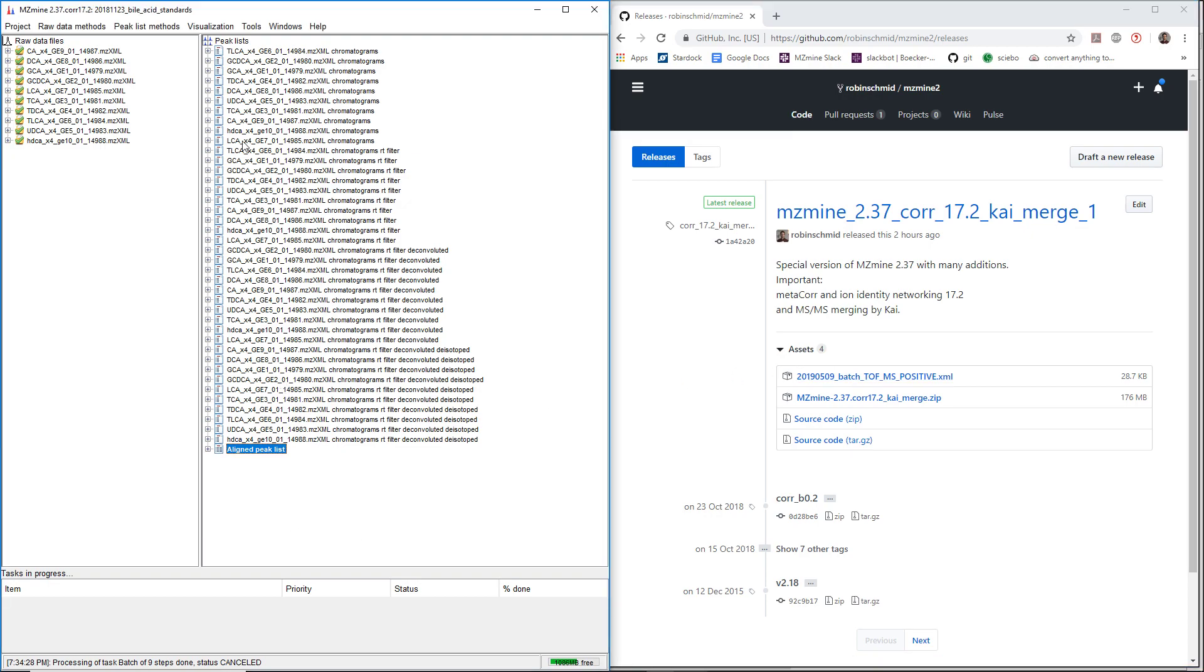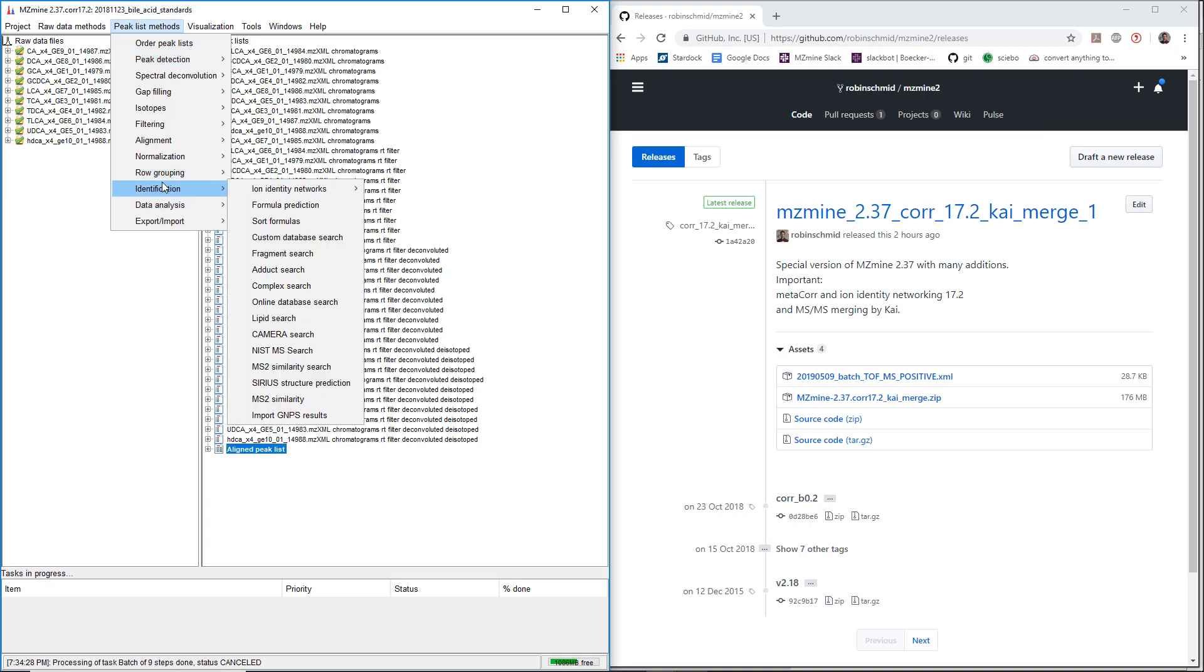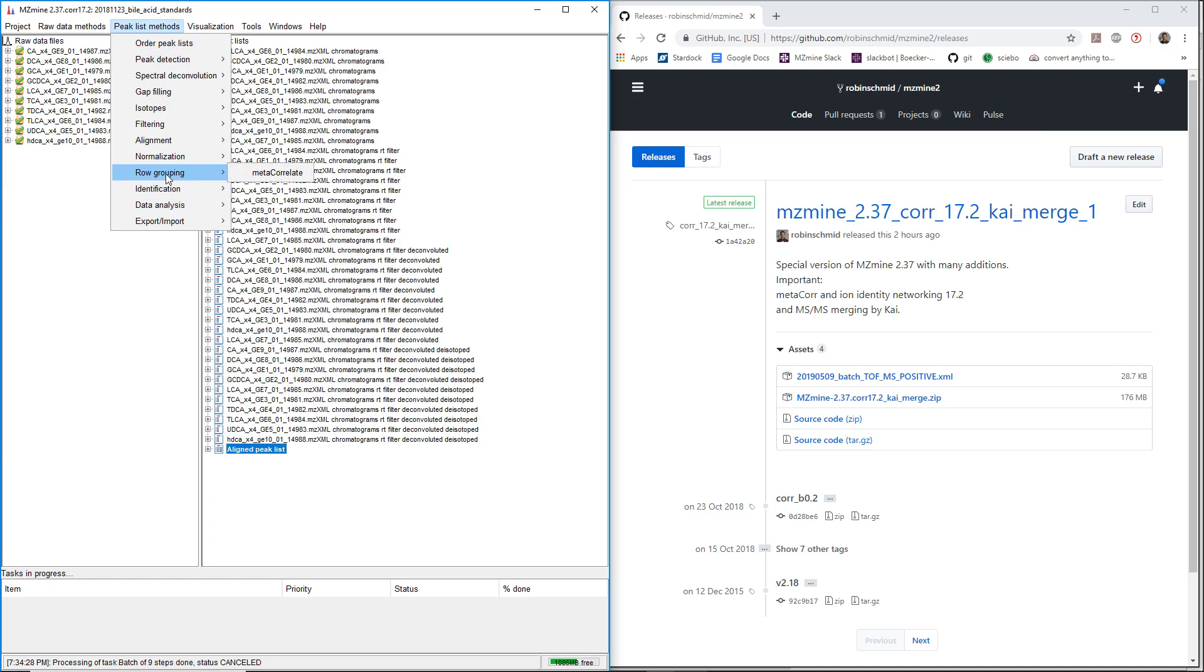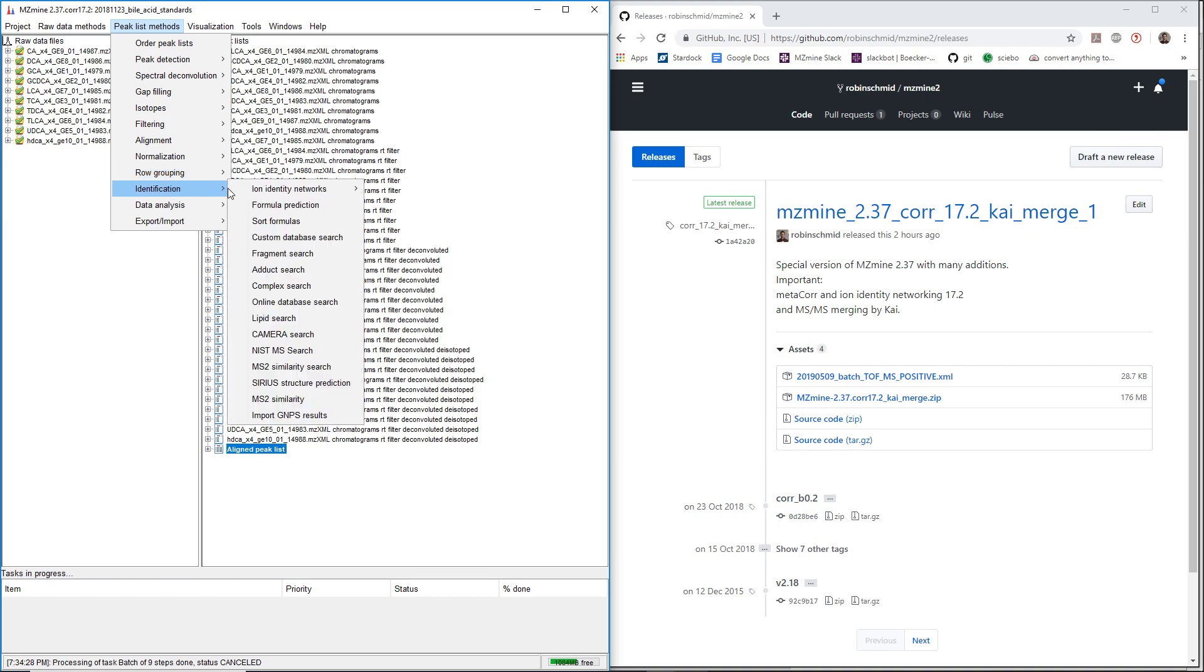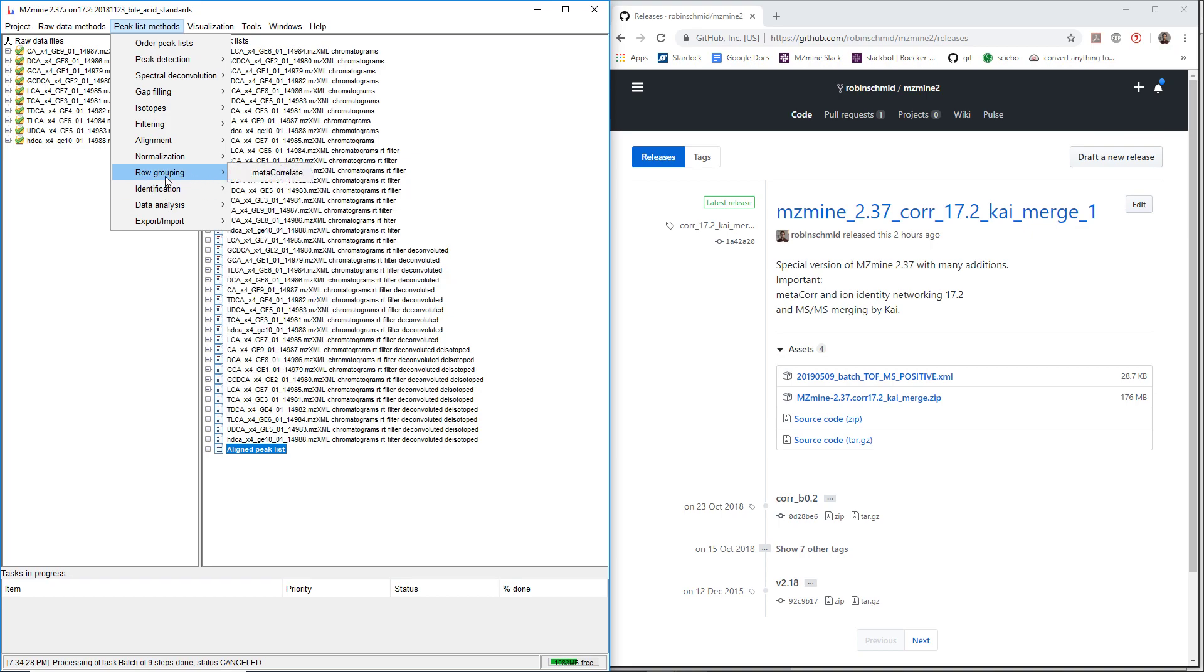After you download, unzip, and start mzmine2, you're going to recognize that you have plenty of new modules here.